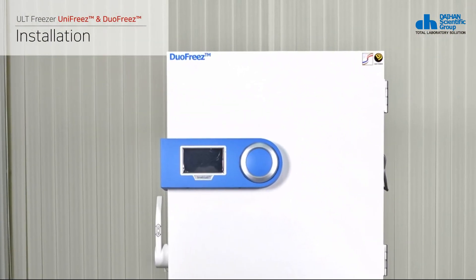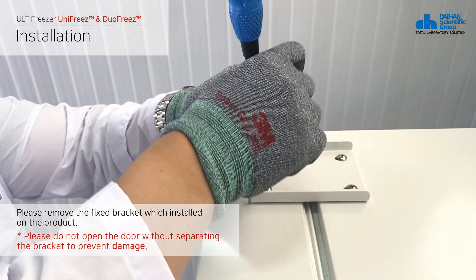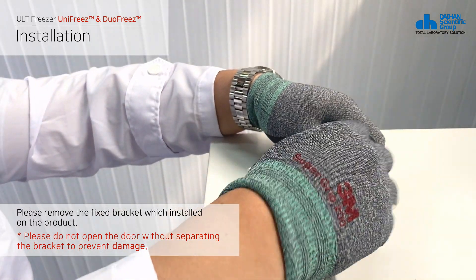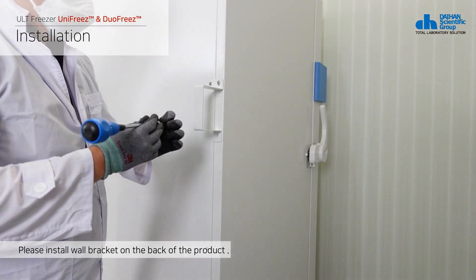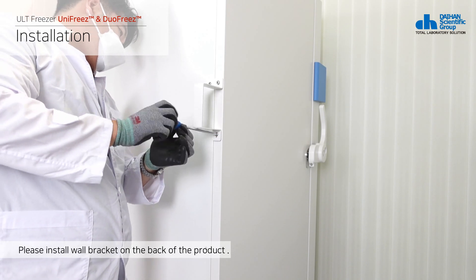This is how to install the product. First, remove the door fixing bracket installed on the top of the product to prevent door damage during transportation. Second, open the door and install the wall bracket from the internal components in the fixed position of the wall bracket on the back of the product.